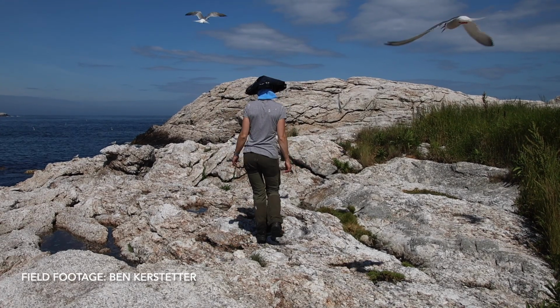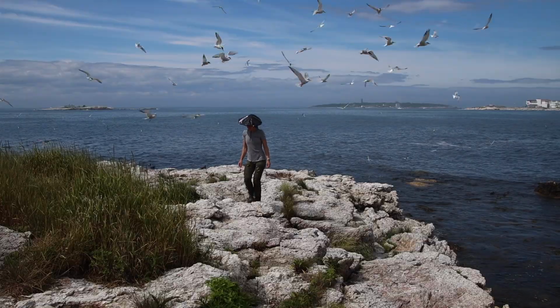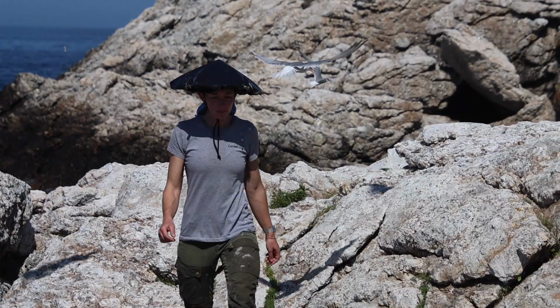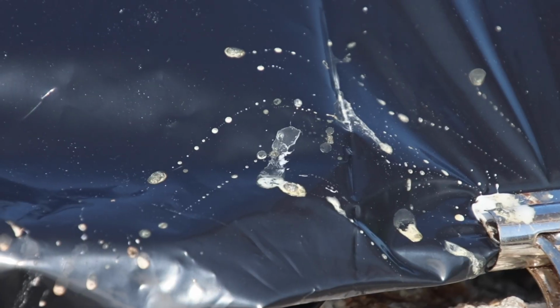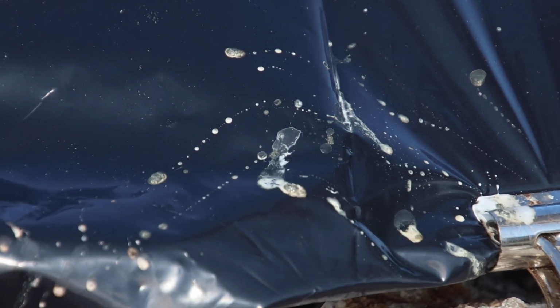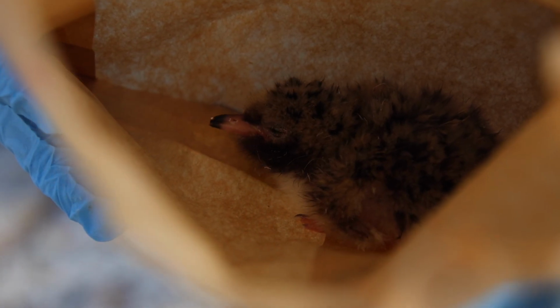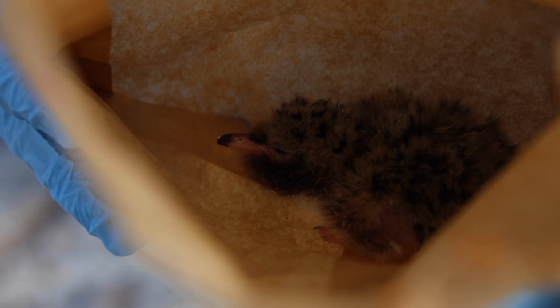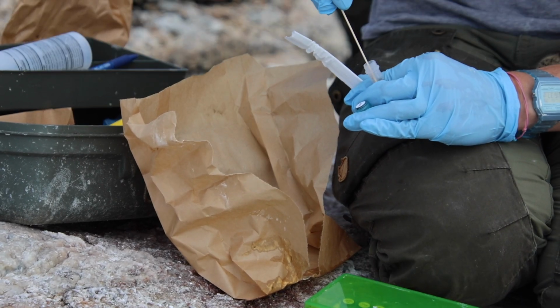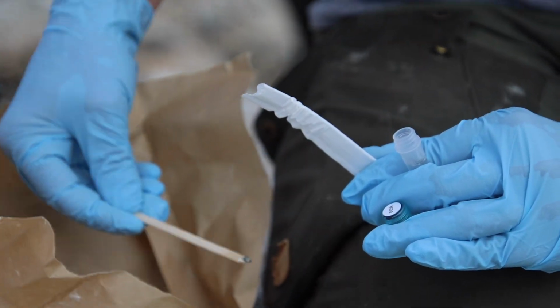There are lots of different ways to collect samples. If you're in a colony of seabirds that are going to poop on you, like this single species colony of common terns, I like to cover my hat with a clean trash bag and just walk around and get pooped on. We can then collect samples straight off the plastic so they're nice and clean and fresh. Putting chicks in paper sandwich bags also works really well. We get nice clean samples from inside the bags, and we only need to collect the chunky parts of the poop, so avoiding the white uric acid.